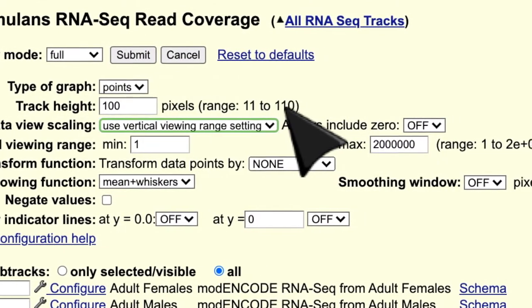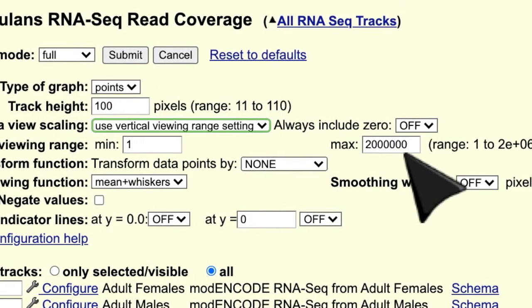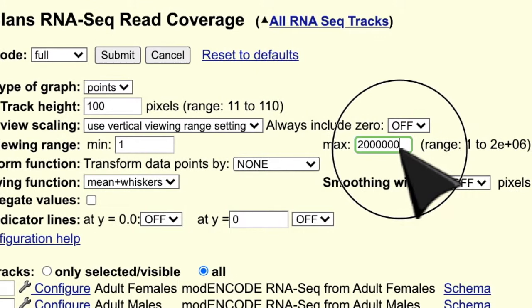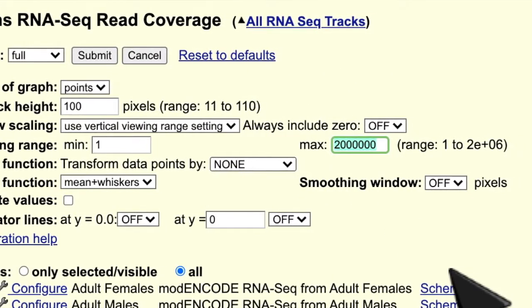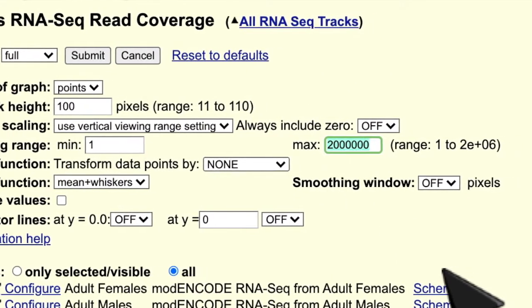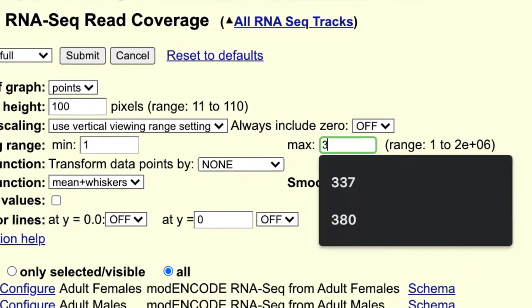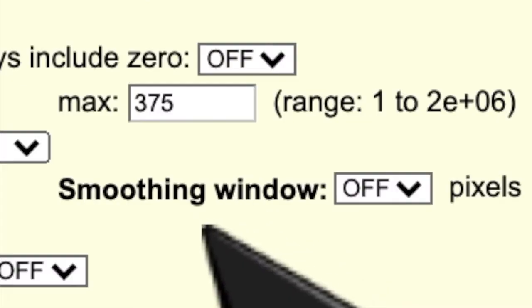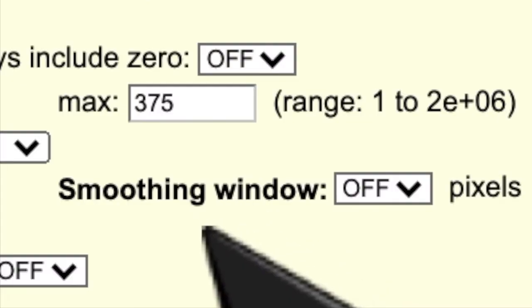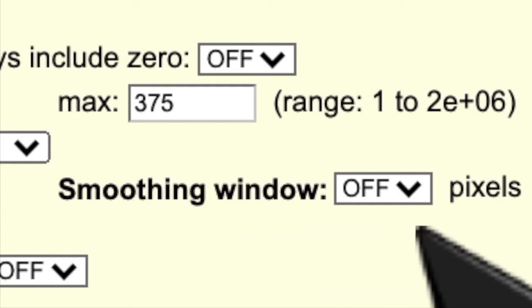Input your max value with a little bit of wiggle room. Since our max value for our window was 373, I'm going to make our max 375. We can also choose at what horizontal resolution we want the reads to be displayed by changing the smoothing window. When it's off, you'll be given single nucleotide resolution.